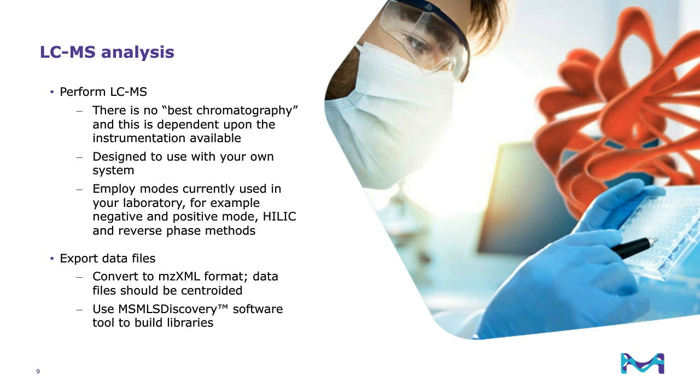Following LC-MS analysis, the data files should be converted to centroided mzXML format prior to uploading to MSMLS Discovery software, as these files are much smaller and process much faster and more accurately than profile data. And both MS and MS/MS files are supported by the Discovery software.